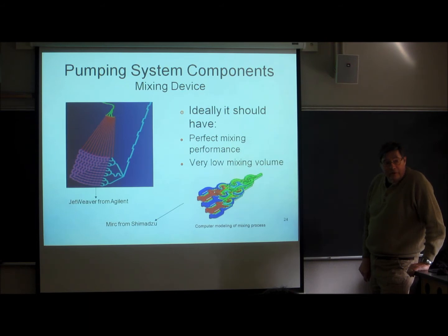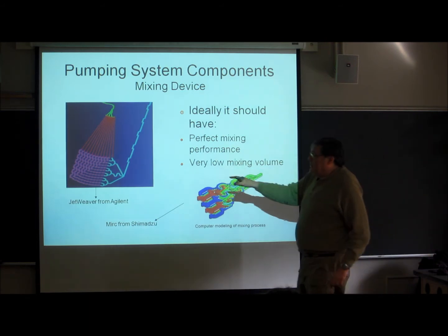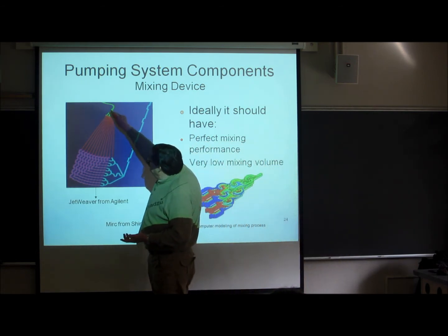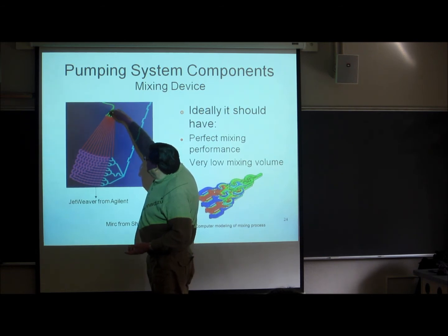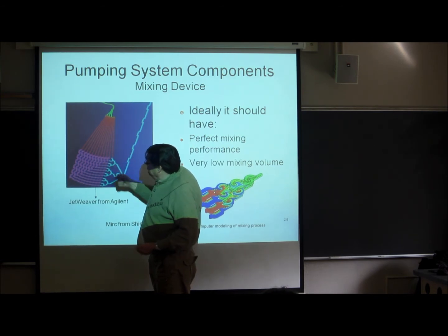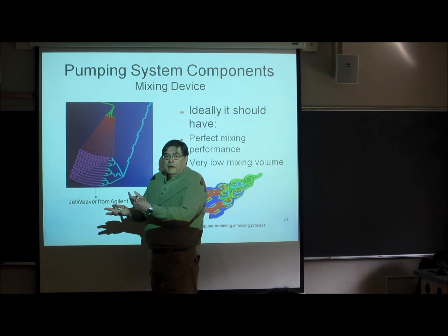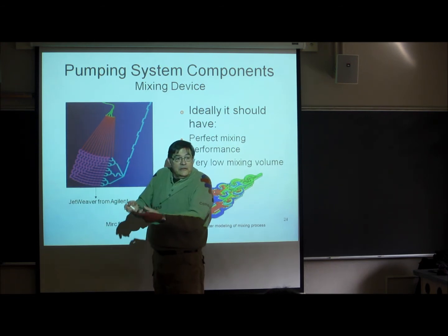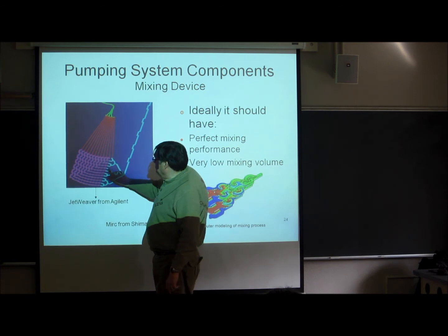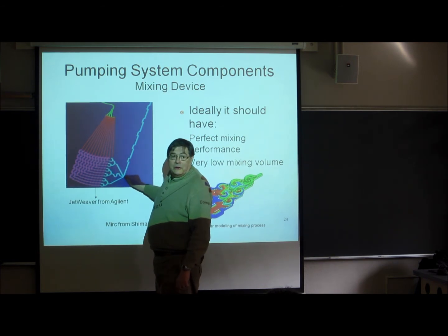They're quite extraordinary. They're very carefully machined, and little pathways are cut into a block, right? And the pathways here come, this is the source of the liquid coming out and breaking down into channels, finer channels, and then taking this circuitous route. These turns and twists will make the liquid tumble and mix it that way. So you pull it apart, mix it, and then reunite it down in here.